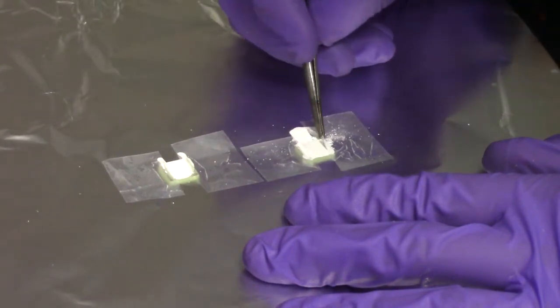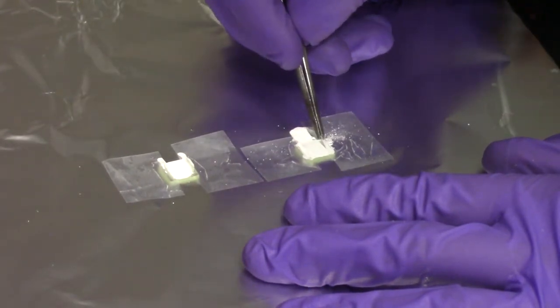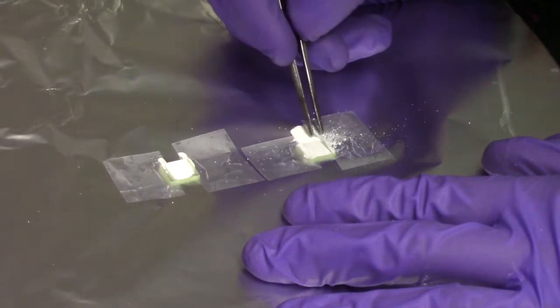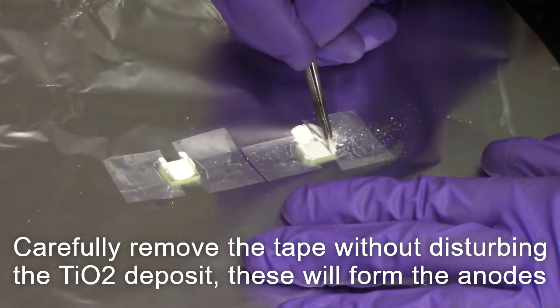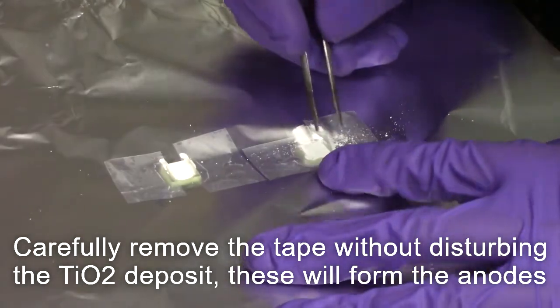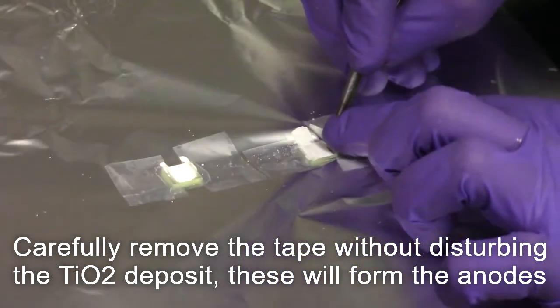After allowing the TiO2 paste to dry, carefully remove the tape off the edges of what will form the anode, taking special care not to scrape the TiO2 deposited surface.